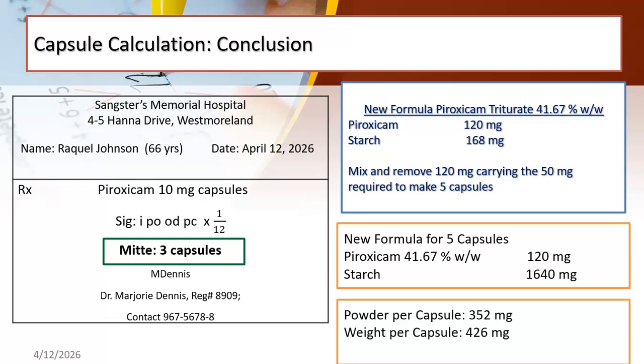Again, if the triturate is less than 50%, the aliquot is treated as though it is the diluent because the diluent is a dominant ingredient, and so the density of that powder or the fill capacity of that powder really is not necessary for any calculation.